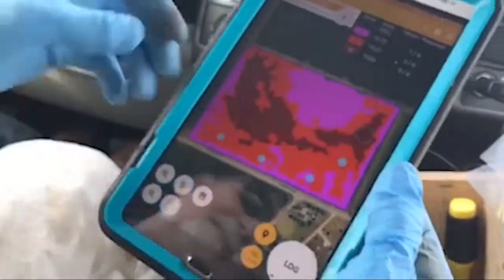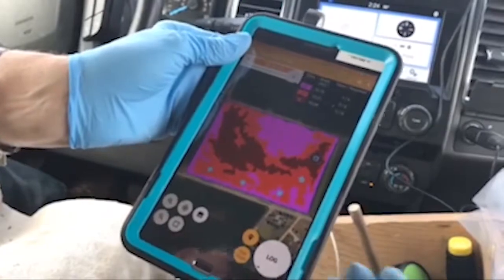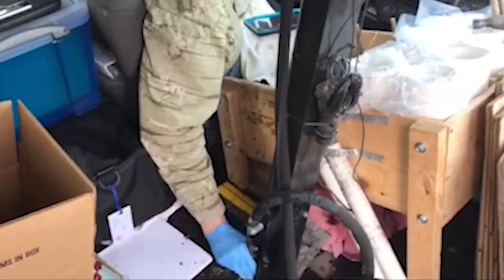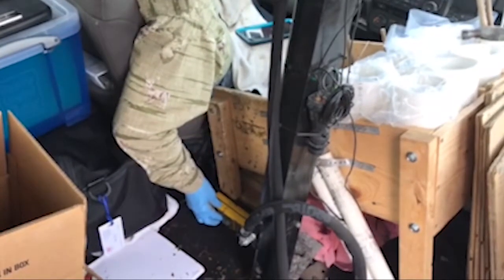I'm going to take a sample right there and I'll hit the log. You can see the point has now been logged on the field. I've got the probe and I'm hooking it up to the hydraulic cylinder.